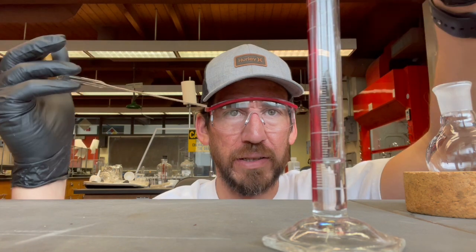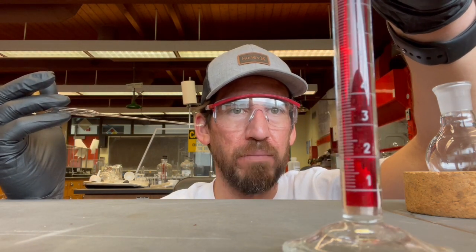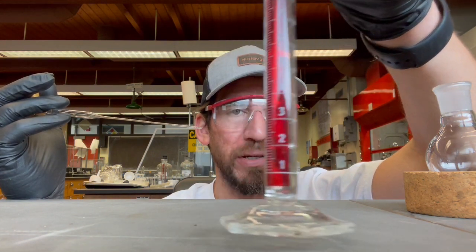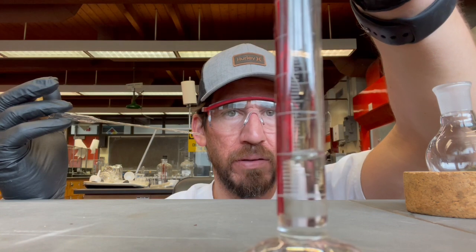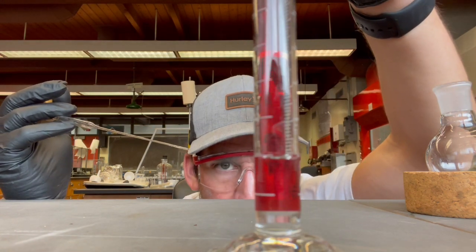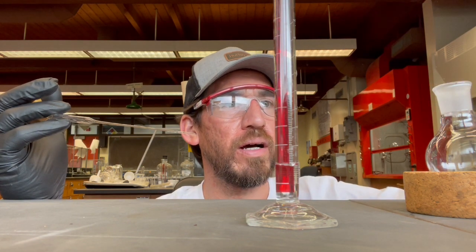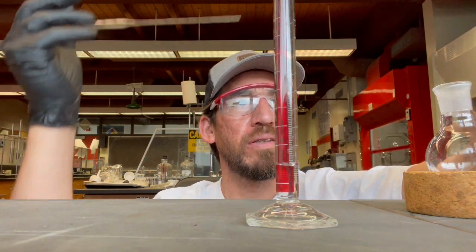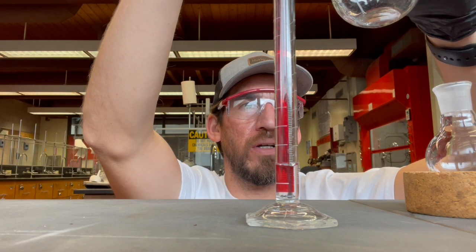Like this distillation popping off a lot faster than I thought. So you can see that's right below 2 mils, okay? That's probably, let me just tell you, 1.9, okay? So let's get this next one. 1.9 for the first one.